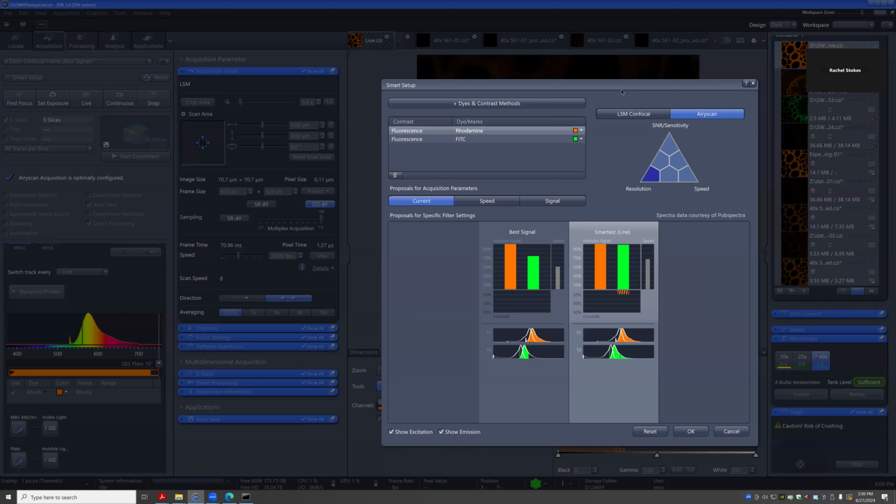SR is super resolution, right? What that means in general terms is it'll do 2x sampling. So it'll sample double of what normal confocal samples. Confocal is always 1x sampling. So any confocal mode will do 1x sampling, and that will be your max. Super resolution is 2x sampling, independent of the speed. If you go to CO8Y, which is a fast mode with confocal sampling, it is the fastest because it has to do 1x sampling versus 2x, just half the pixels. So it'll be a lot quicker.